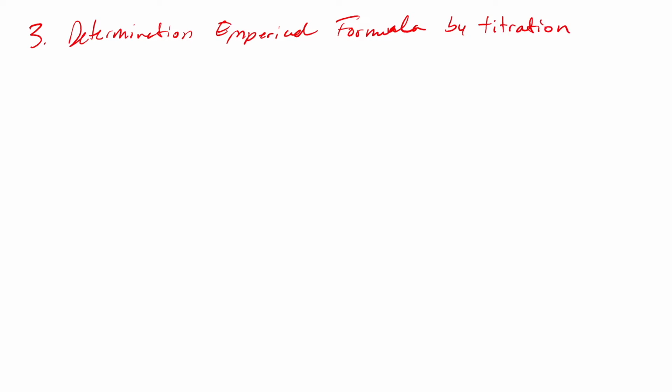Okay, by titration. So since we're using EDTA and we're using copper, just so you know, EDTA stands for ethylene diamine tetraacetic acid. And when you mix that with copper chloride, and I'll just put the copper part here because that's all we really care about, that's what's going to interact. You get EDTA doing what we call complexing or chelating copper at a ratio of 1 to 1. So for every molecule of EDTA there's going to be one copper atom.